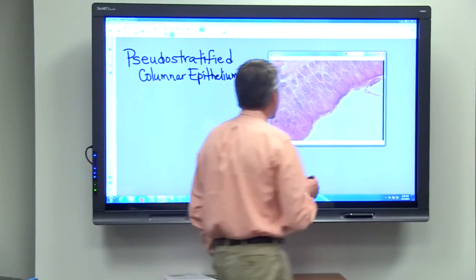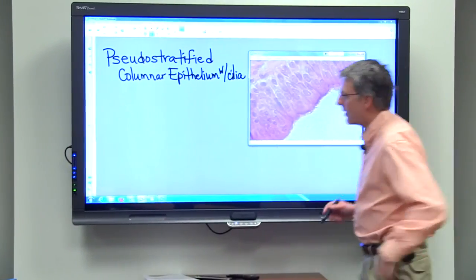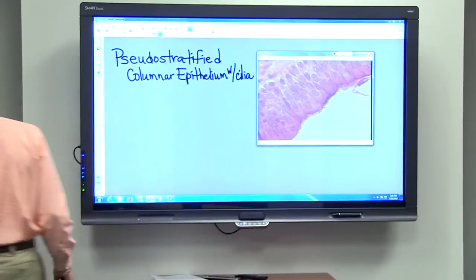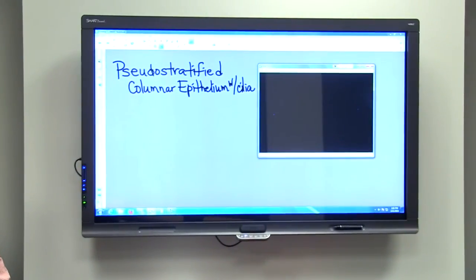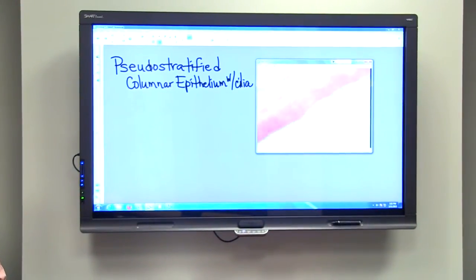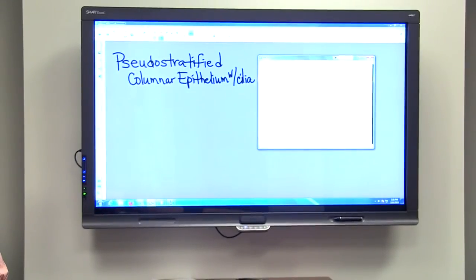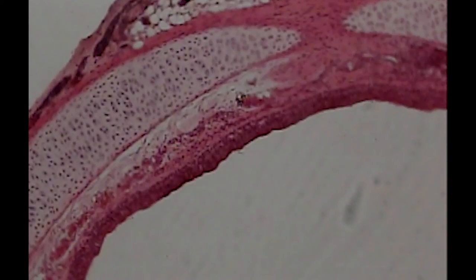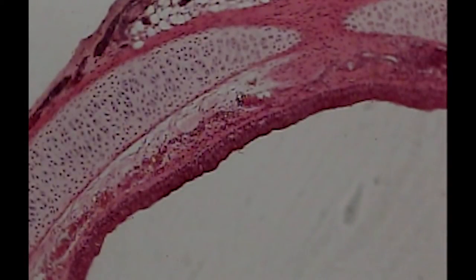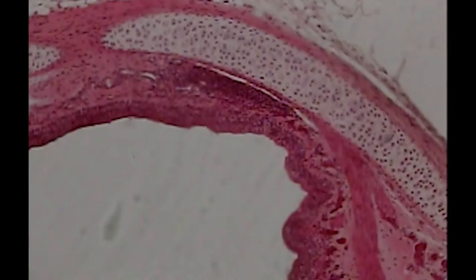It's a little hard to make out on this particular slide. If I drop back, you can get oriented a little better perhaps. Here you can see that we have a trachea.